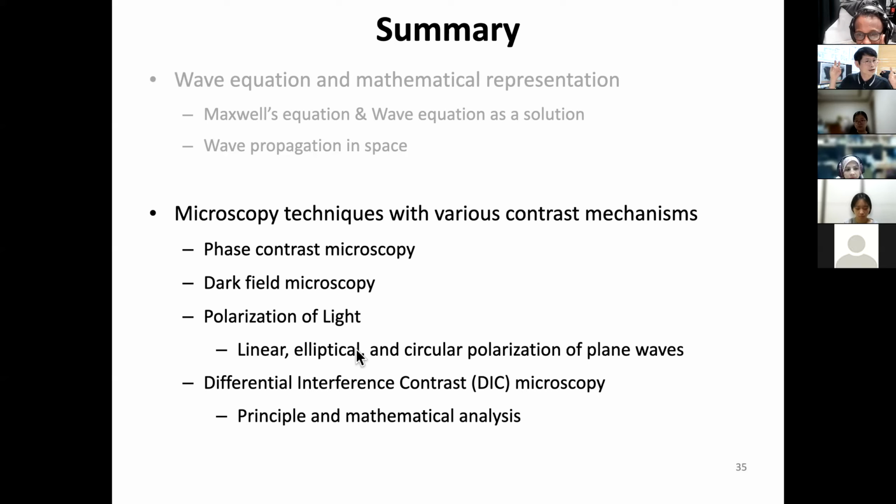For example, introducing the Wollaston prism to separate and combine polarizations, and through the sample, converting the optical phase difference into an intensity as a differential. That's a very, very cool technique, and here comes the DIC microscope. We now try to understand this in a little more mathematical way, in terms of the Fourier transform. So you will see that even light can do a Fourier transform itself. I mean, the nature of these optics can do the math by itself.